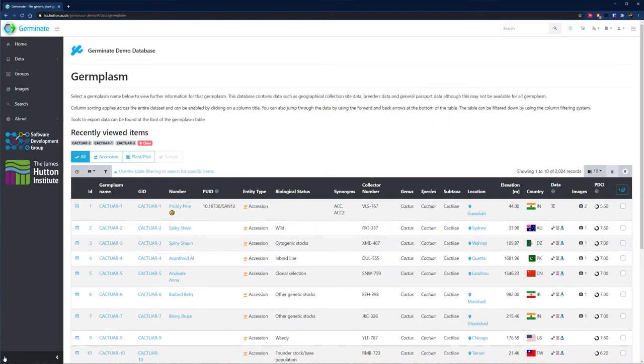This short tutorial has highlighted some of the cool features the Germinate interface offers, but the best way is to just dive in and start having an explore.